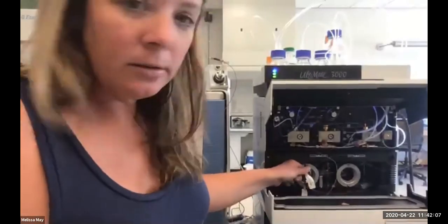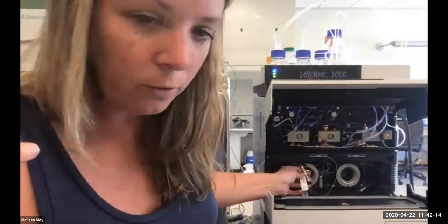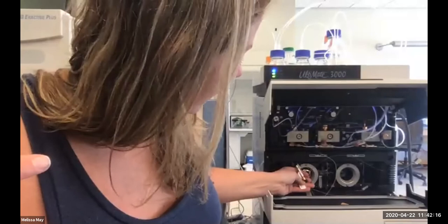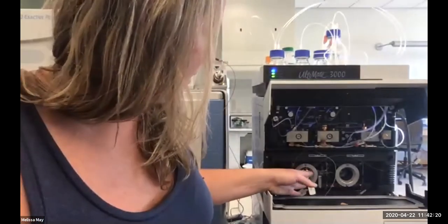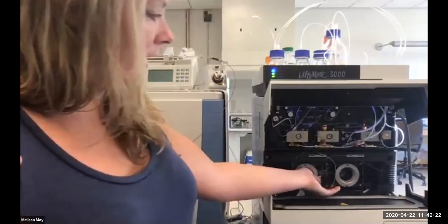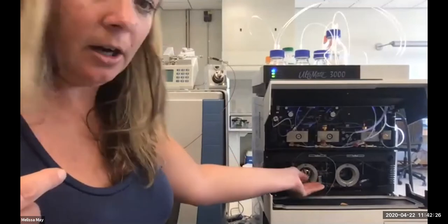So trap column is right here. It's this huge metal, this isn't actually the column, this is just the holder for it. You can see that all of our fittings have these Viper plugs, which is good because it helps to create a nice seal. This right here, which I'm gonna try to be very gentle with, is actually our column.